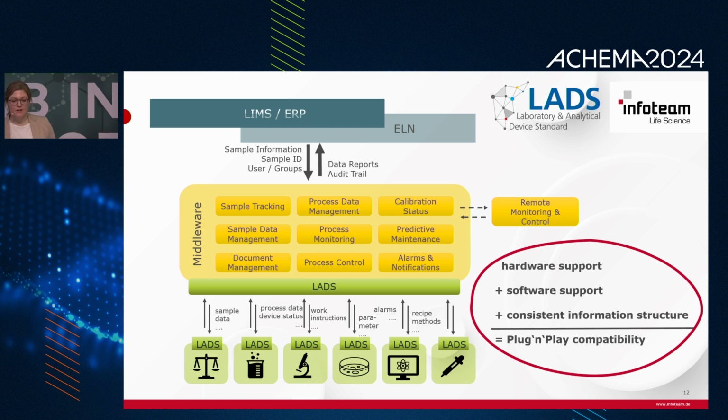So the middleware exchanges information with the devices via LADS, just input and output data, and thereby also expands the functionalities of a standard ELN. So for the plug-and-play compatibility, we need the hardware support of the devices, the software support, the LADS server, and with that, a consistent information structure, and then you can just add new devices to your system without changing your whole system.